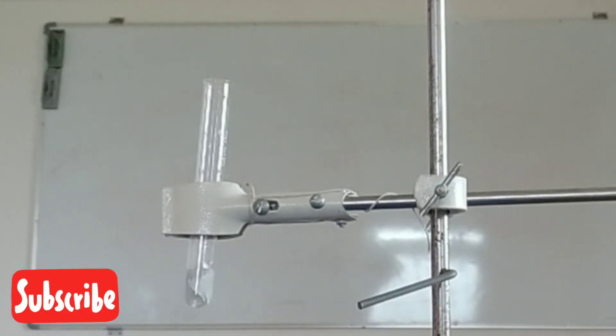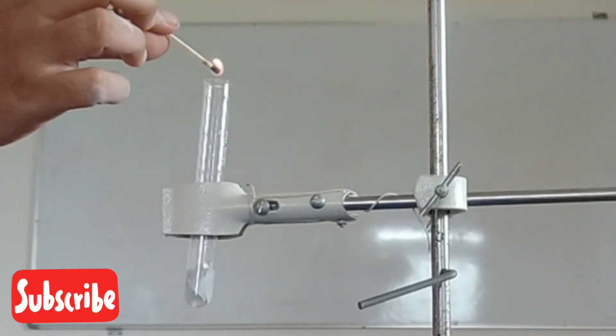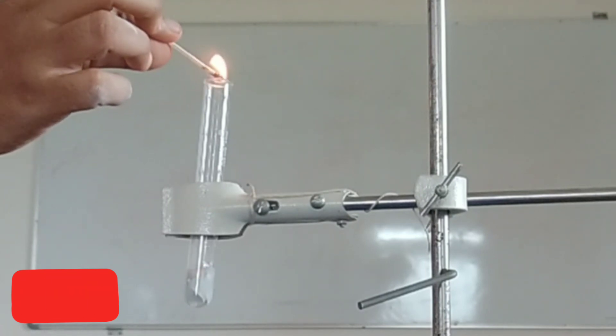What do you observe? You will notice some bubble formation in the test tube, right? What gas is that? Let's check it out.